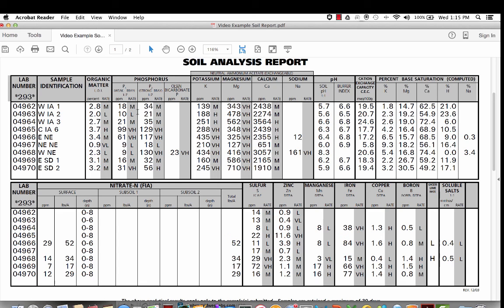When we see numbers higher than the 1:2, so we've got a 1 to maybe 4 or 1 to 6. In the case of this sample from western Nebraska, that ratio was actually greater than 1 to 10. It tells us there's a lot of fertility that's not being shown in the P1 Bray. In this case, we ran the Olson and found that the P1 Bray had been neutralized by the basic soil, and the Olson was a more appropriate number to use to make fertilizer recommendations.